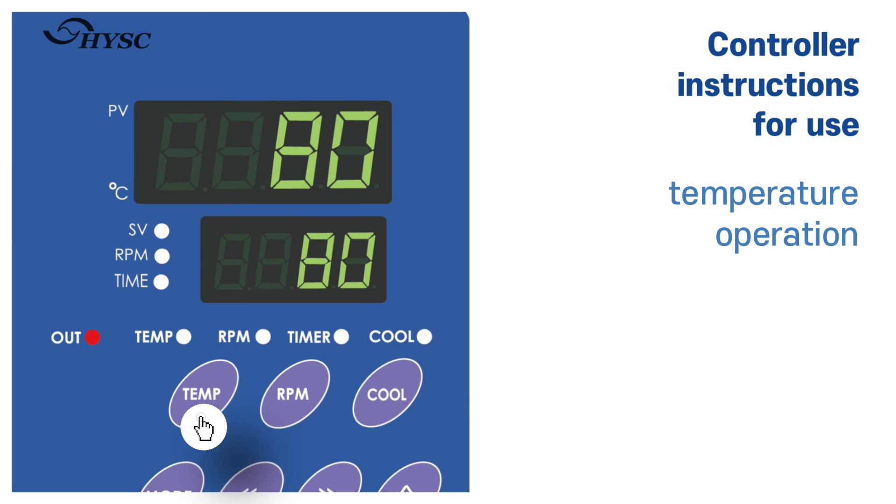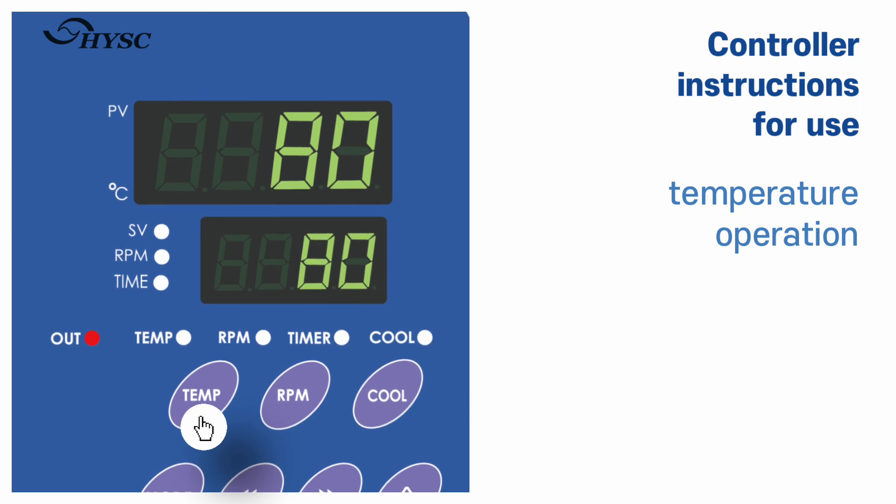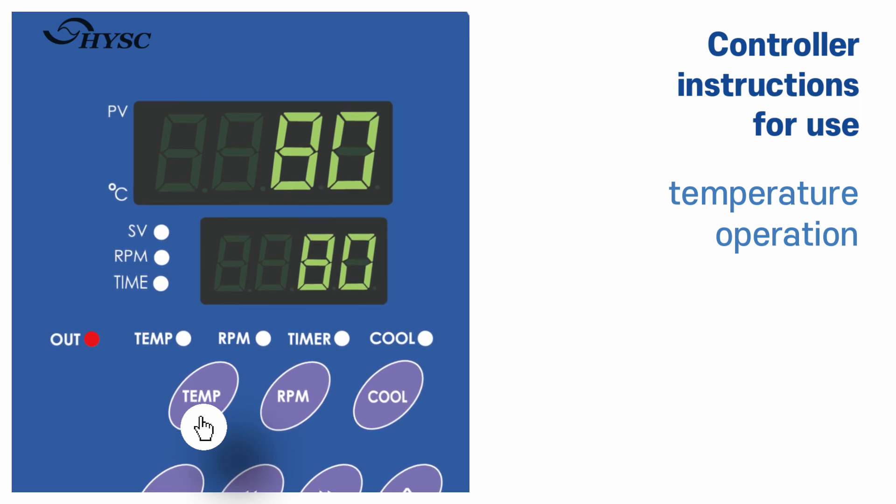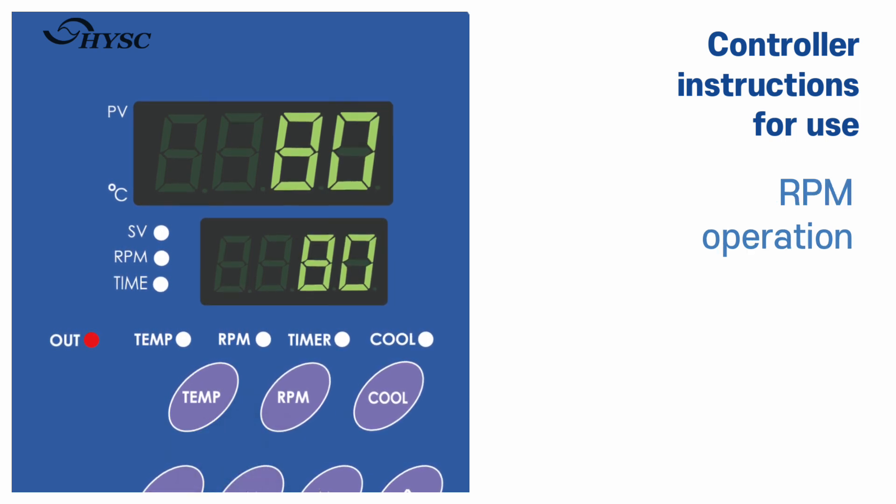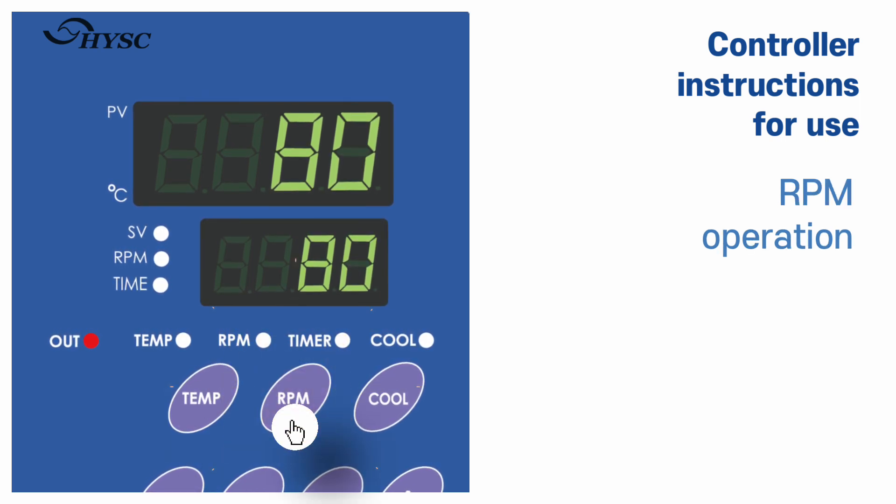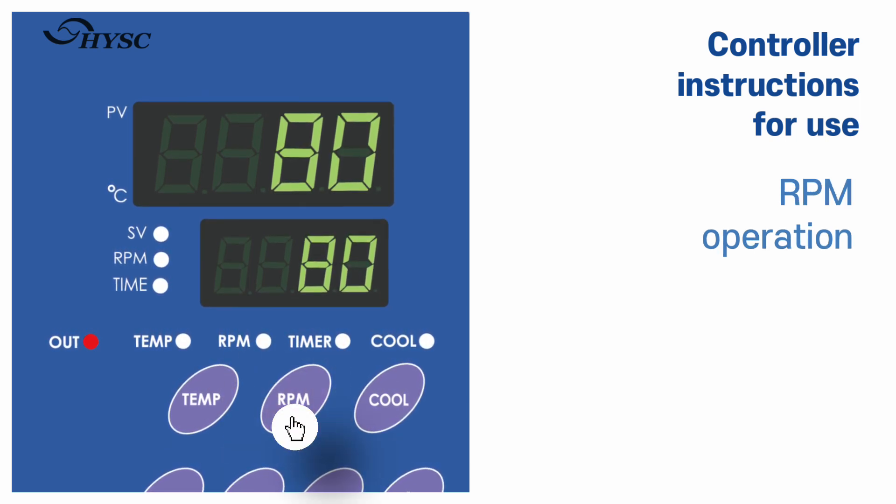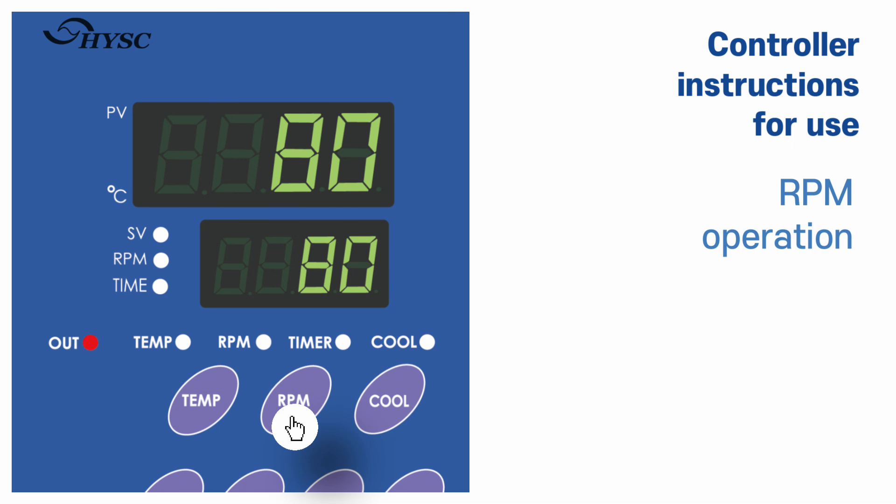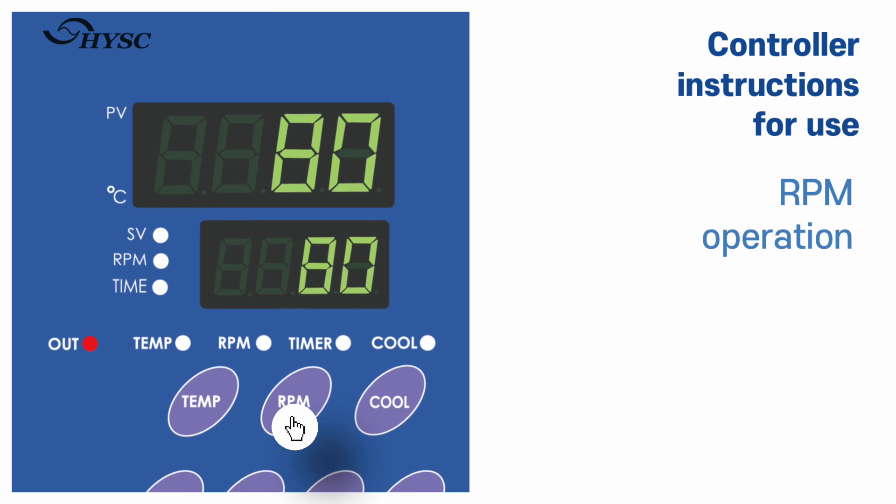Pressing the temp button is to start operation at the setting temperature. Pressing the RPM button is to start operation at the setting RPM.